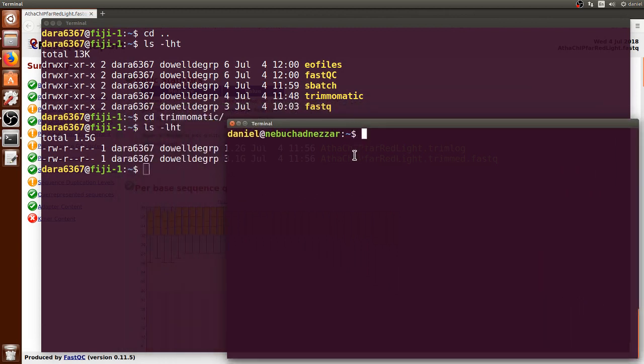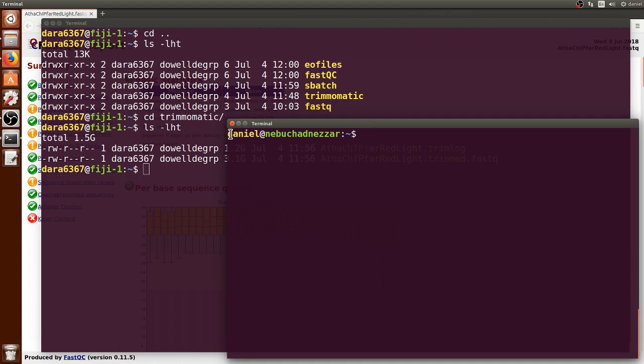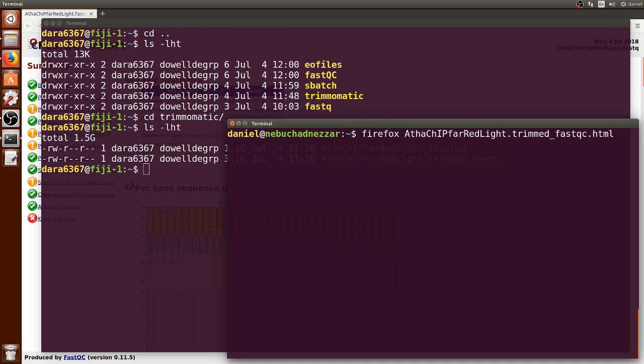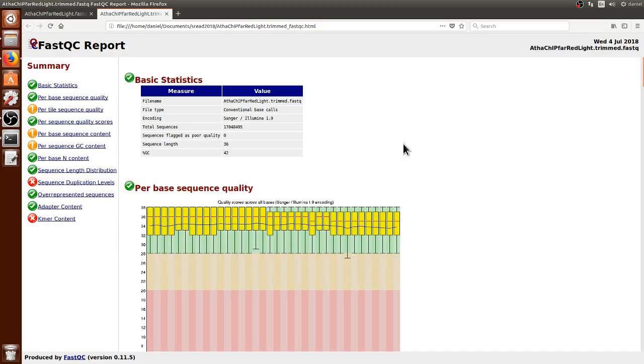This new terminal is not connected to the computer cluster, it's my own computer. We can open the new HTML file using a web browser like Firefox. We can use the autocomplete and just press enter.